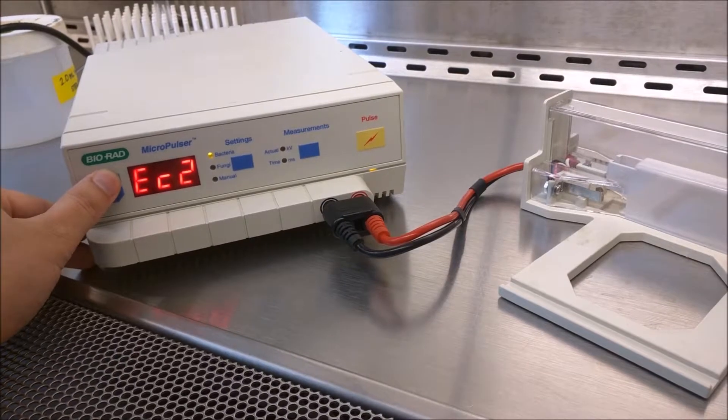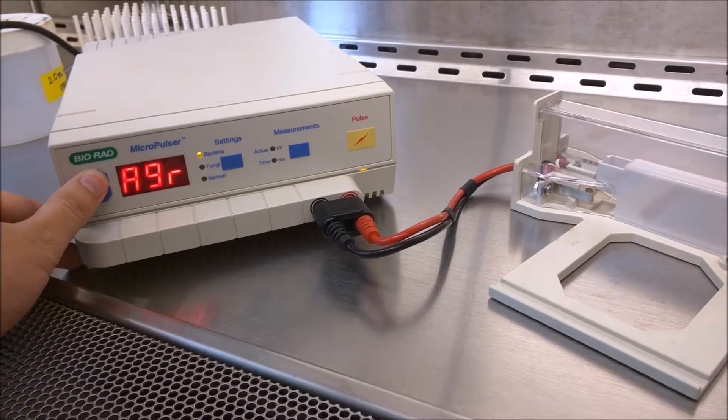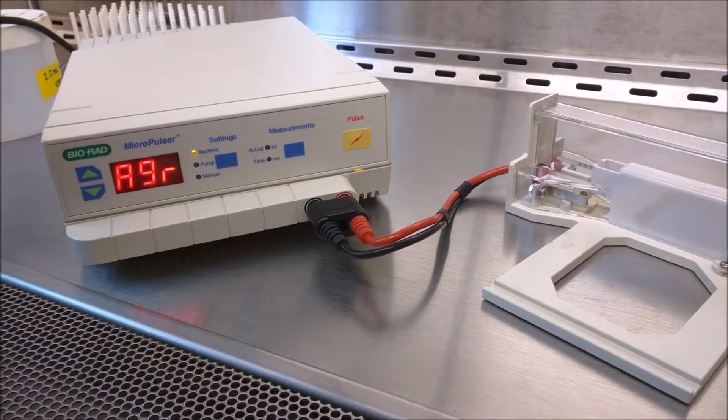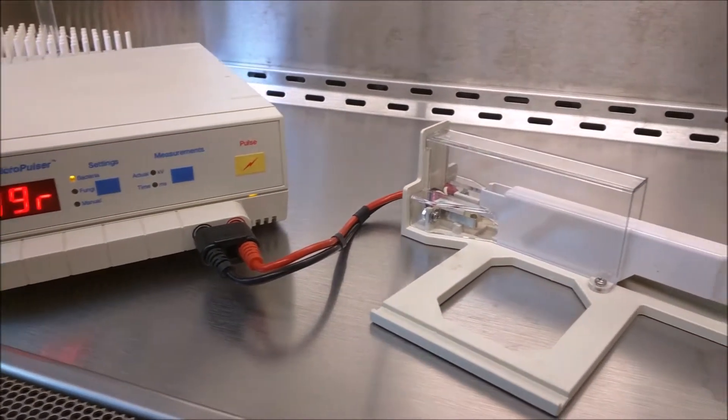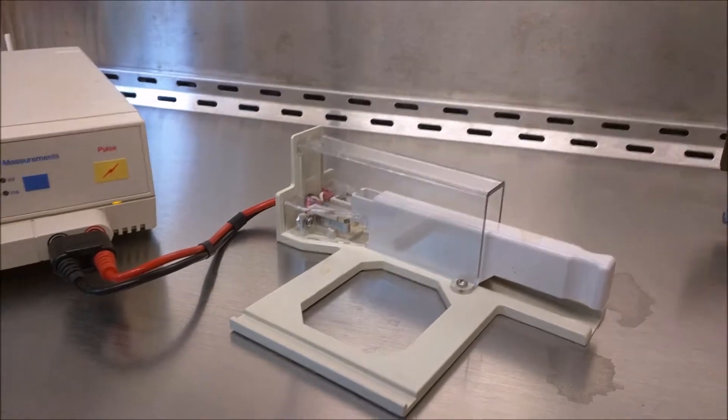First we need to insert our plasmid into Agrobacterium. This is a Bio-Rad electroporator. I'm setting it to Agro. This machine applies an electric field to Agrobacterium to increase the permeability of the cell membrane.